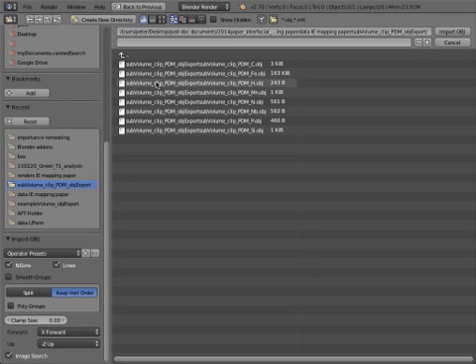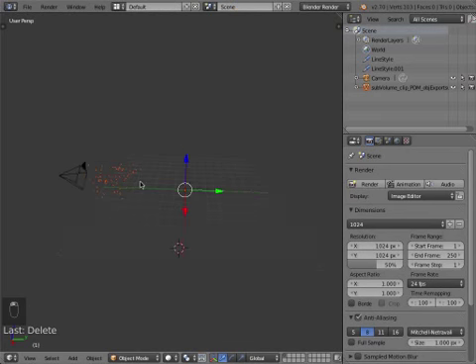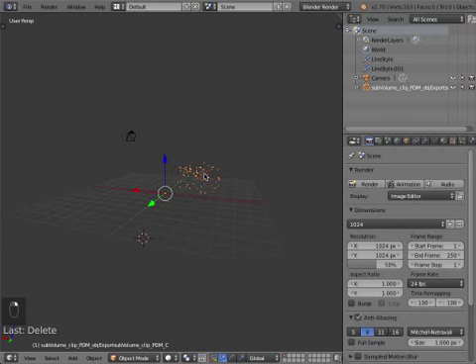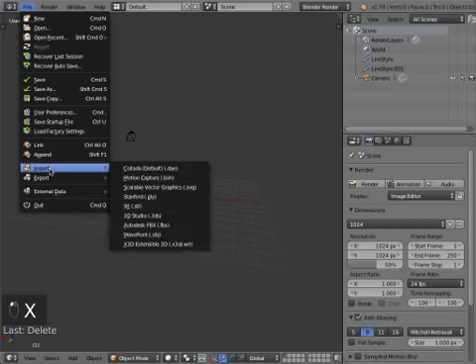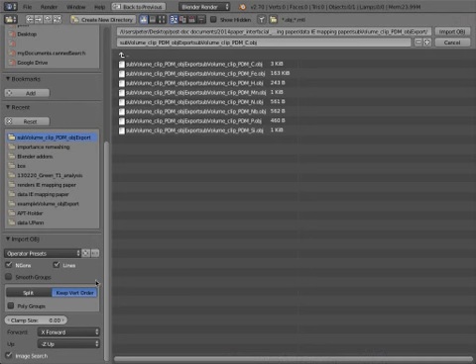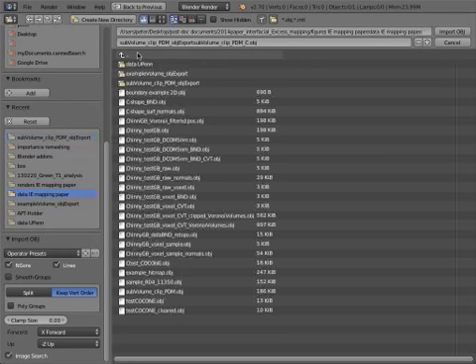That looks like Ginny's data. So that's some carbon around a grain boundary, if I remember right. I'll just import that and we'll see. Yeah, that's not a lot of data. So that's the clipped volume. Sorry, I'll delete that. One thing you'll notice is that now when I run it again, it's still stuck to the same settings here, but you'll need to do that whenever you launch Blender again.